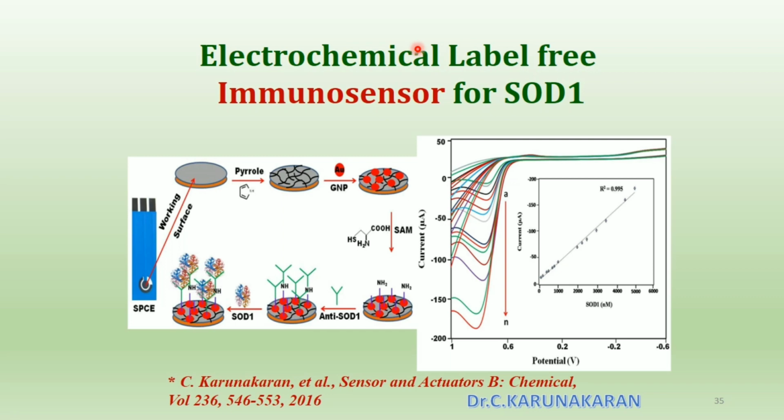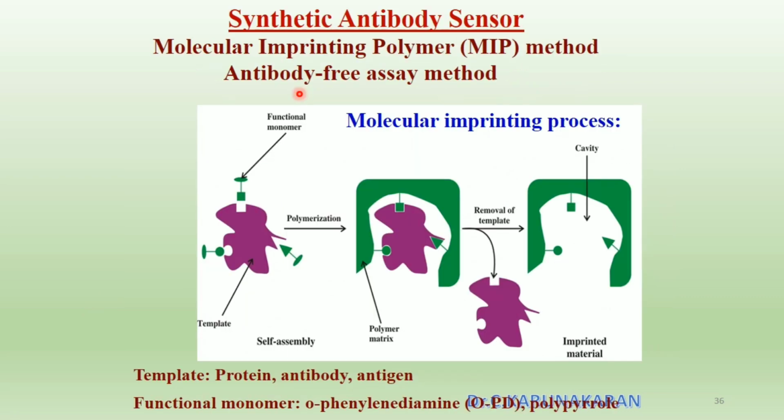Further, an electrochemical label-free immunosensor for SOD1 was developed by immobilizing SOD1 antibody on the electrode surface. So far, we have used antibody based biosensors, enzymatic biosensors, immunosensors. These antibodies and enzymes are very expensive. So we have used in this work a synthetic antibody based sensor.